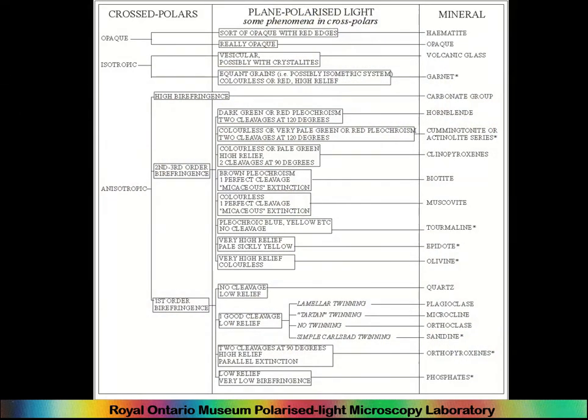So this sheet I will be using to talk about these properties, and as you can see, they can be divided into properties involving cross-polarized light and properties involving plane polarized light. Okay, although some actually are cross-polarized light, but we'll get to that.